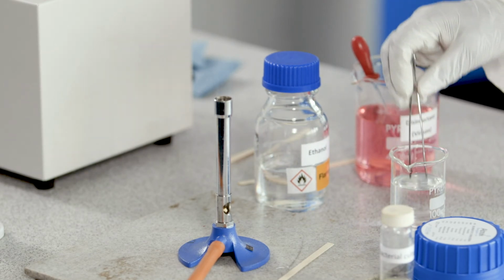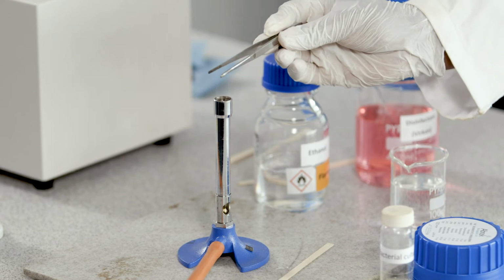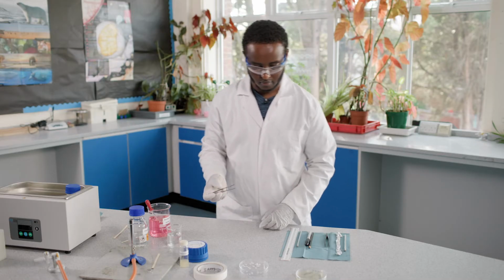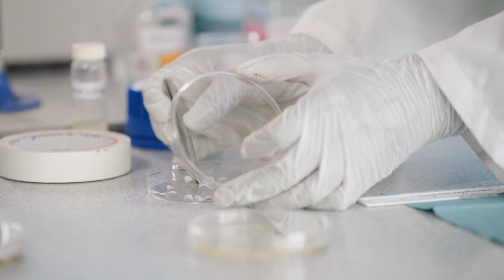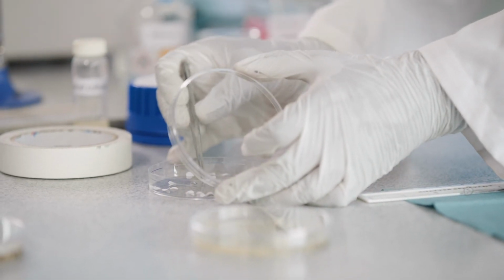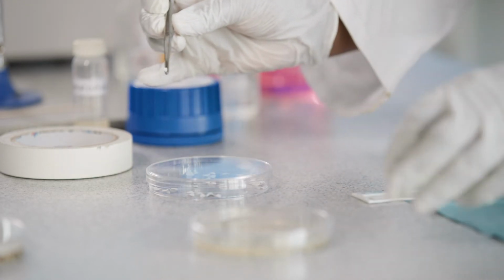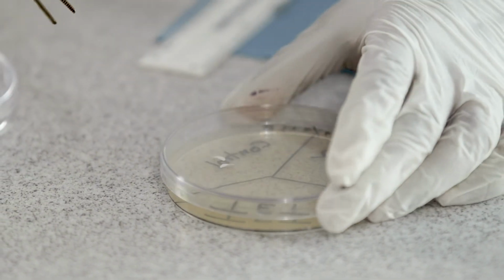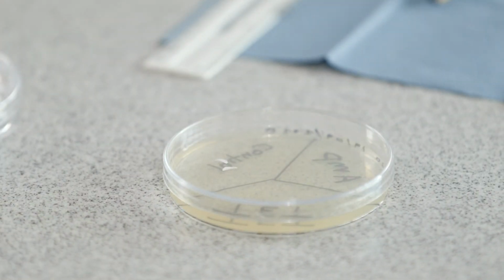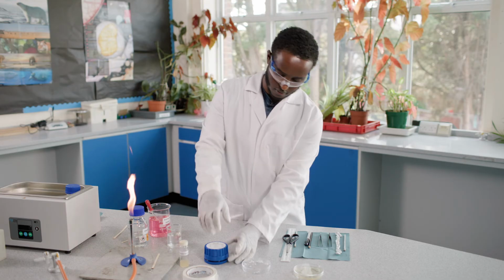Sterilize the forceps by dipping them into ethanol, then passing them through the Bunsen flame to ignite the ethanol. Use the forceps to pick up the sterile filter paper disc. Lift the dish lid just enough so that the forceps do not touch the bacterial layer on the agar in the dish, and carefully add the disc on the section labeled control. Replace the dish lid as quickly as possible. Sterilize the forceps again.